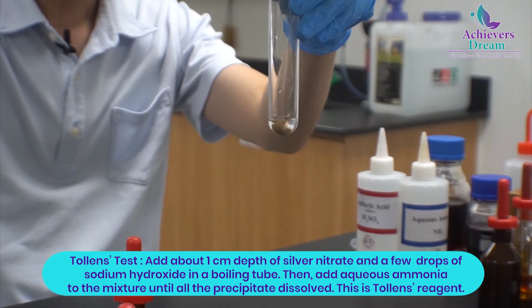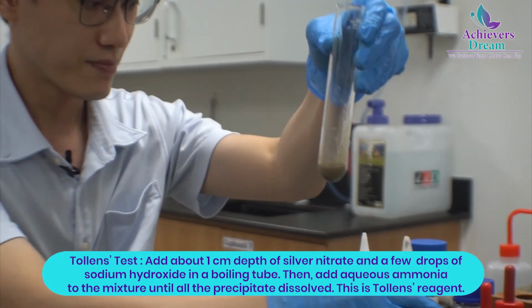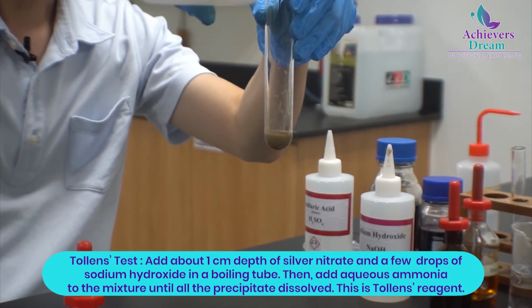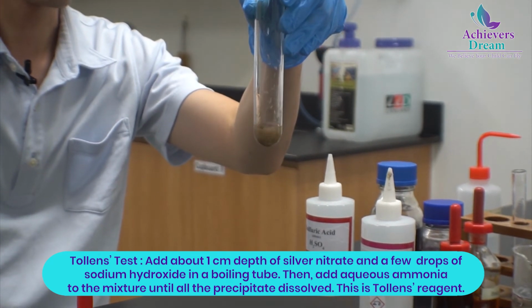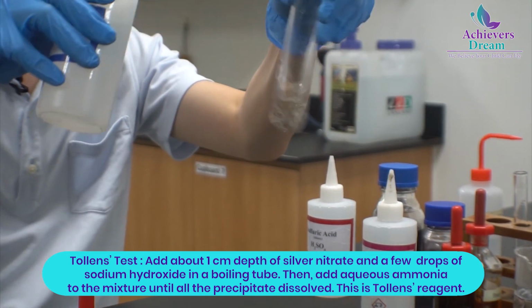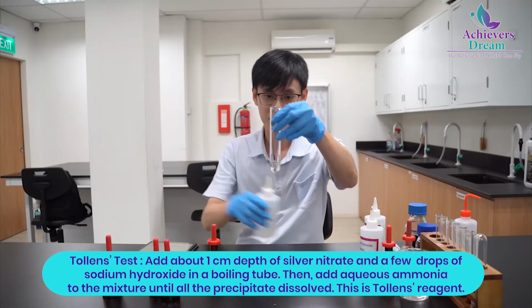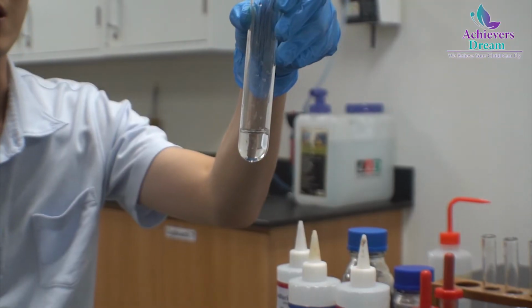As you can see, the brown silver oxide has precipitated. After that, we'll be adding some ammonia in excess to re-dissolve the silver oxide to form the silver diamine complex. That is essentially Tollens' reagent, silver diamine. Let's add a little bit more. As you can see, the solution is now clear.